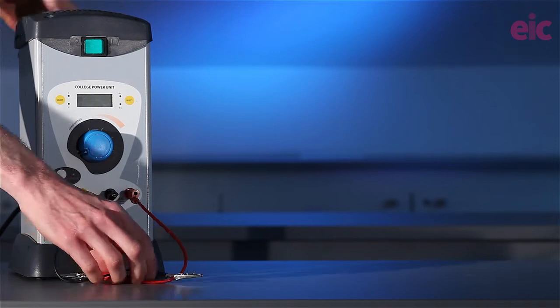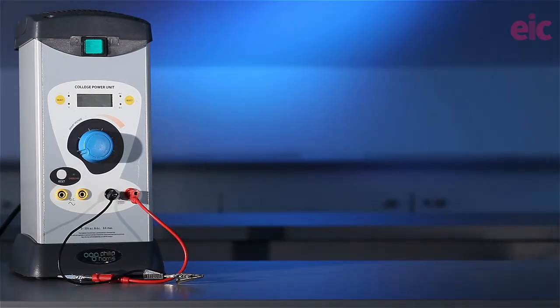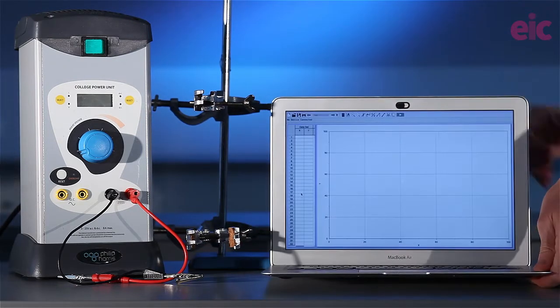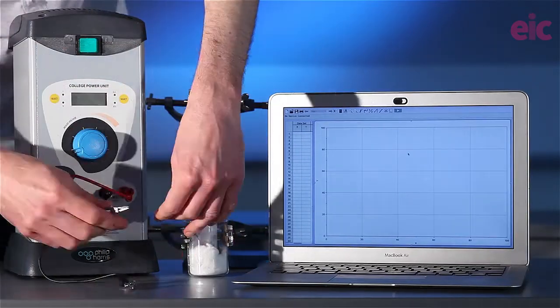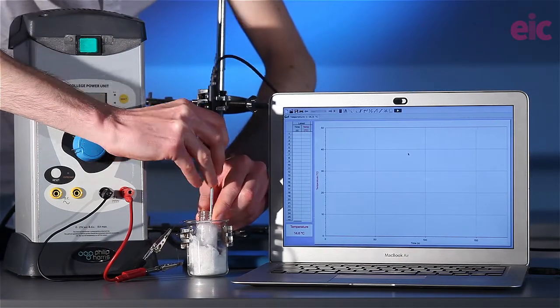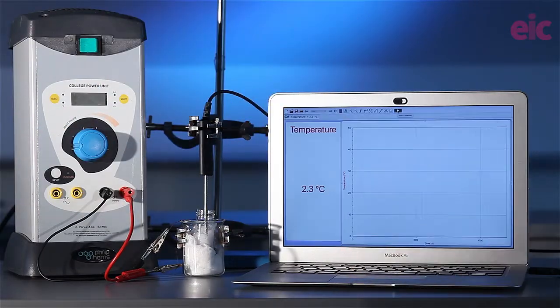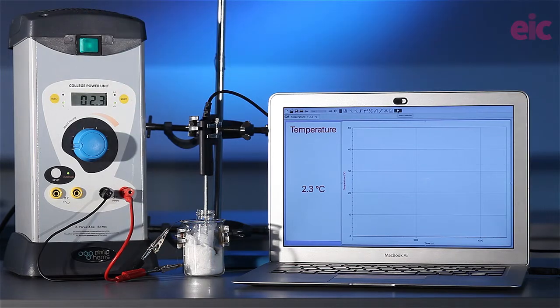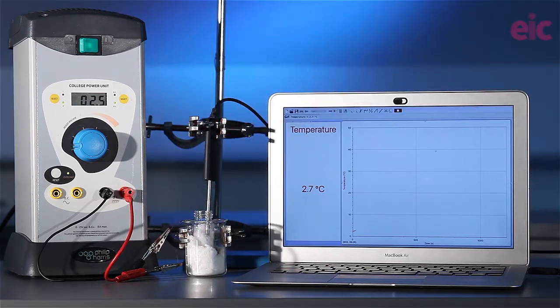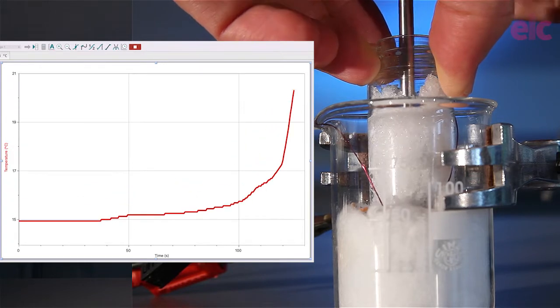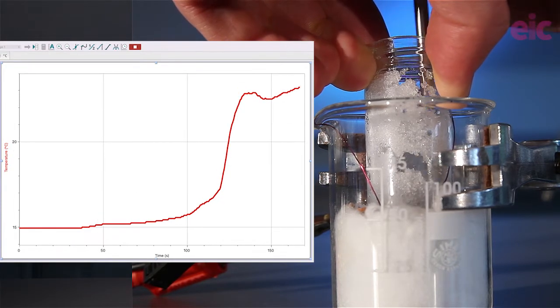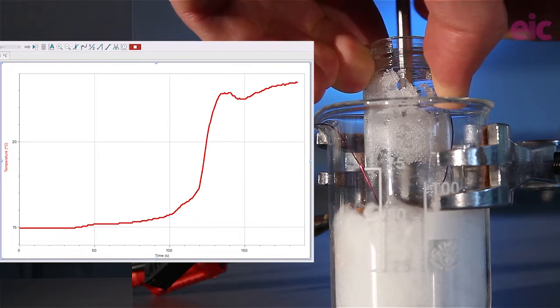Set up a classroom power supply capable of delivering five amps, the data logger allowing for about a thousand seconds of data collection, and a clamp stand ready to hold the thermometer. Ensure the room is well ventilated, remove the loaded vial and heating element from the fridge, and loosely clamp the thermometer over the vial. Wait for the temperature reading to stabilise before starting data collection. Turn on the power supply to deliver about three to four amps of DC, loosen the clamp, and start stirring the powder with the end of the probe for even heating. At around 23°C the solid will begin to melt, at which point you can clamp the thermometer in the liquid and add a small amount of cotton wool around the rim to minimise vapour loss to the room.